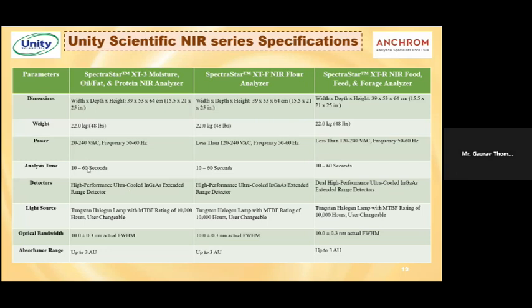So for analyzing various samples and getting those results, it has this high performance ultra cooled InGaAs detector, extended range detector. So InGaAs indicates the different elements that are used in this detector that we have: indium, gallium, and arsenic.